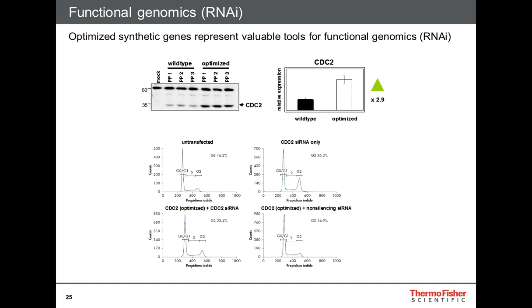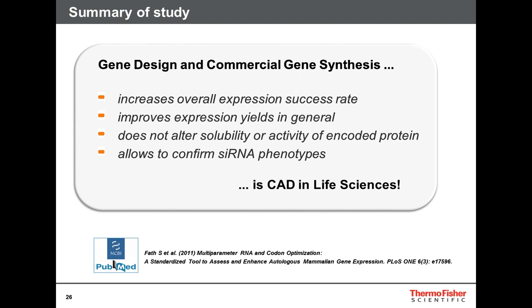So that's a very interesting feature of optimized genes to validate siRNA functionality.